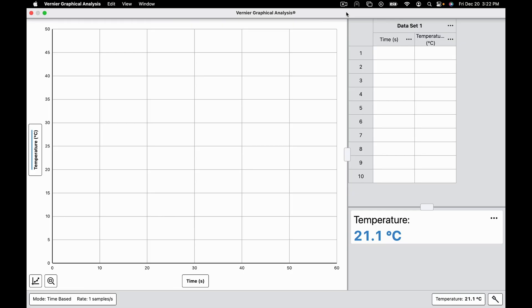This is a brief video showing some of the features found in the Pro version of Graphical Analysis that Logger Pro users will be familiar with.